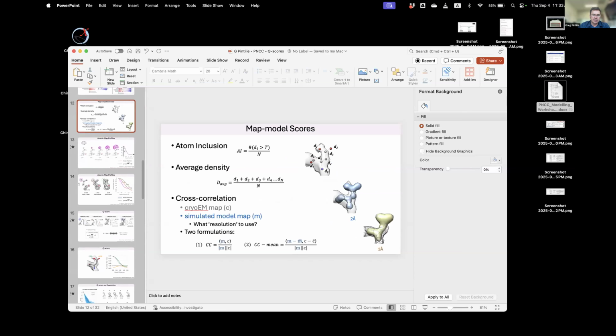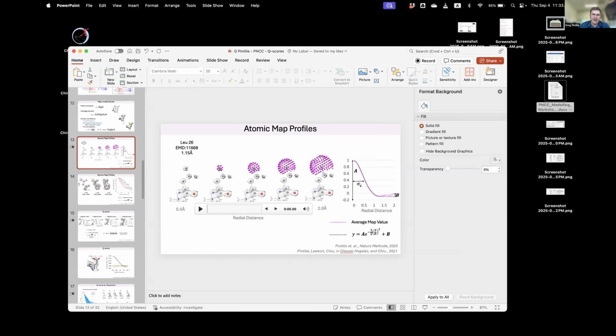I'm not sure I can explain why, but when you subtract the mean, you start to get negative values. And if you're multiplying negative values, but in your signal you have positive values, which is like the complete opposite, it spreads out the score and makes it a little bit more robust.